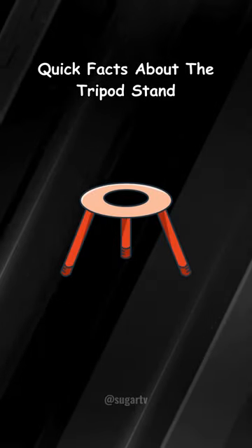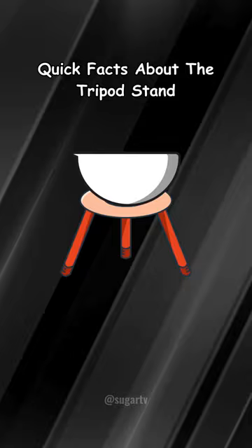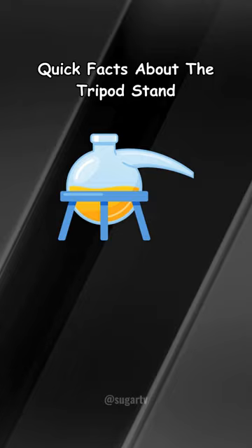The laboratory tripod stand is a fundamental apparatus used in scientific settings to support various equipment such as beakers, flasks, and crucibles during heating. Composed of three sturdy metal legs and a central ring or mesh, it provides stability and elevation for heating devices over a Bunsen burner or other heat sources.